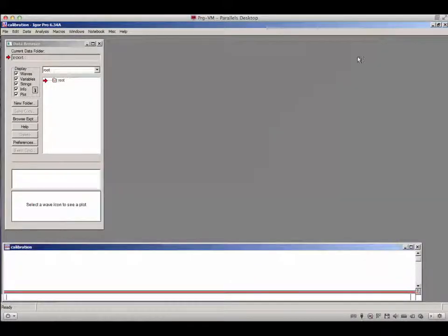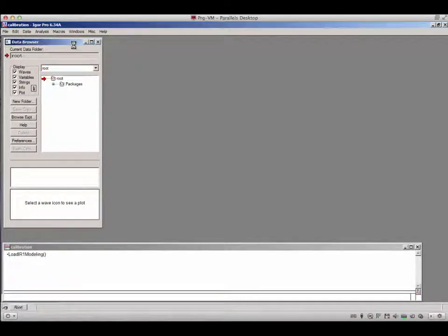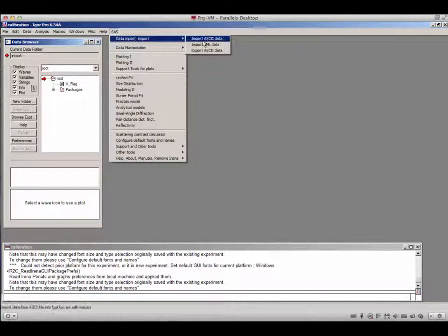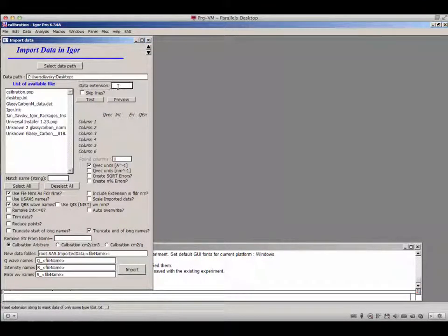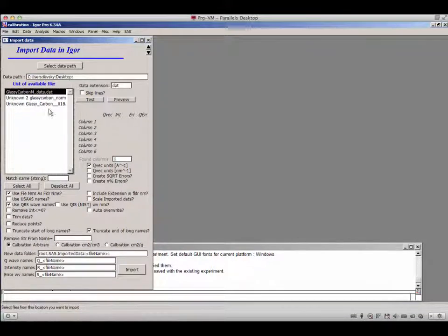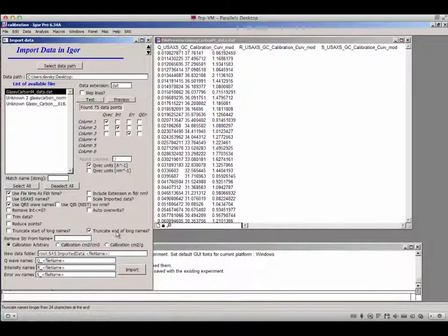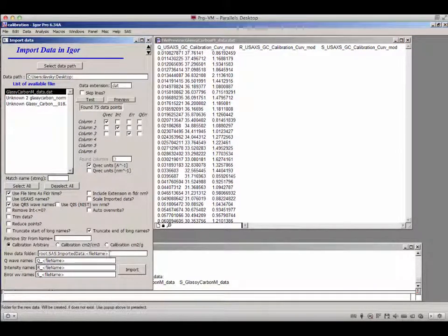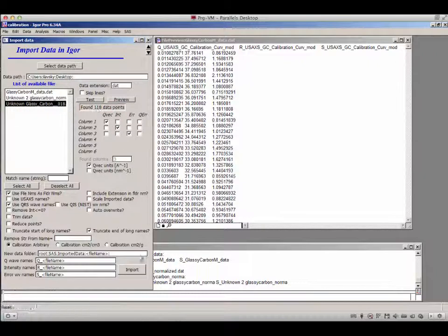Let me show you how to do it. I will go into Igor Pro, load the IRENA macros, then import the ASCII data. I have several data sets on my desktop. I have my standard glassy carbon data — this is what you would get from me via email. It contains Q vector, absolute intensity, and uncertainties. I will import these, then import two other sample data sets as well.